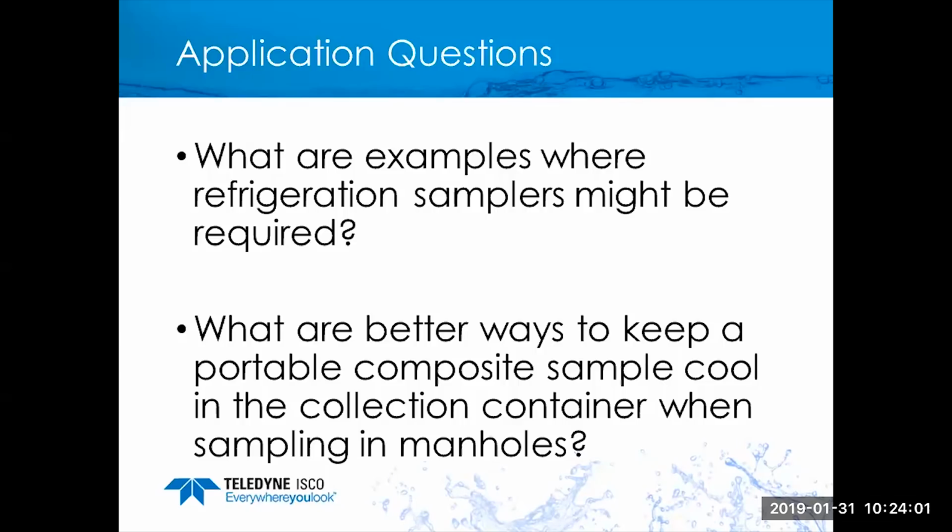So typically when you're dealing with portable again, and there is the need for active refrigeration, it's going to be more of an application where there's more of an event routine where you're waiting for something to happen rather than a regular daily, 24 hours a day, 7-day-a-week sampling routine.